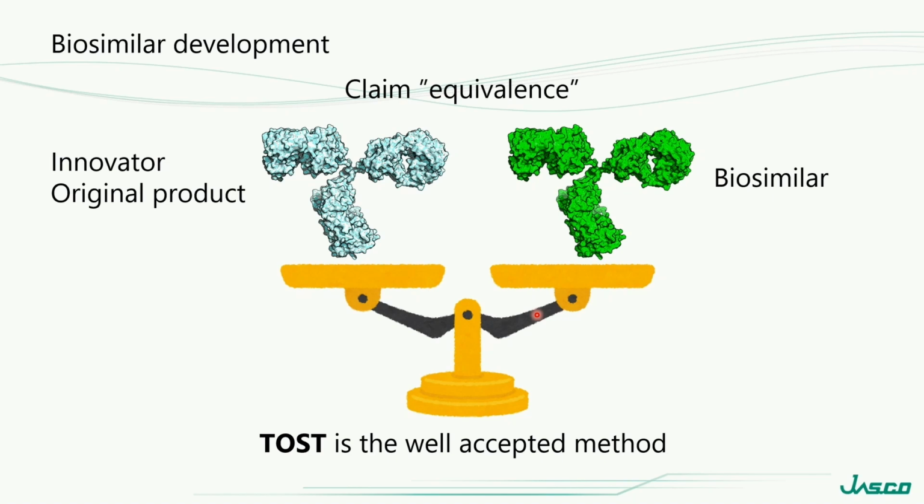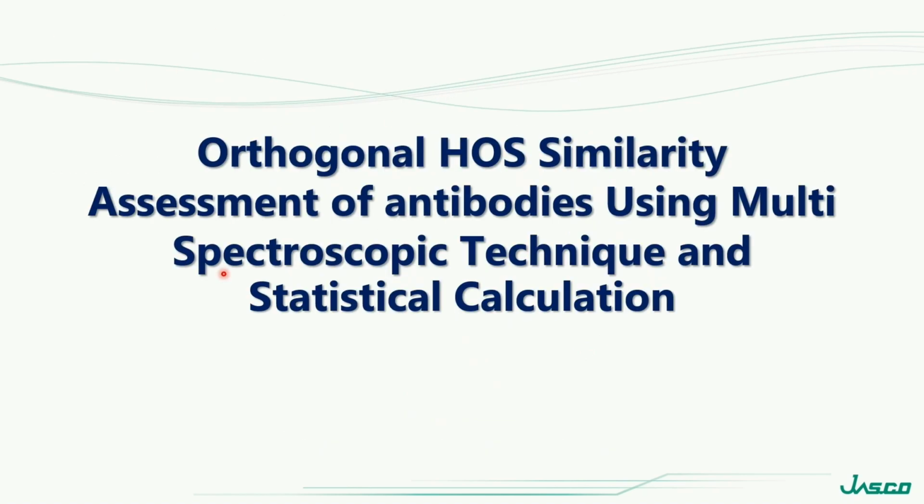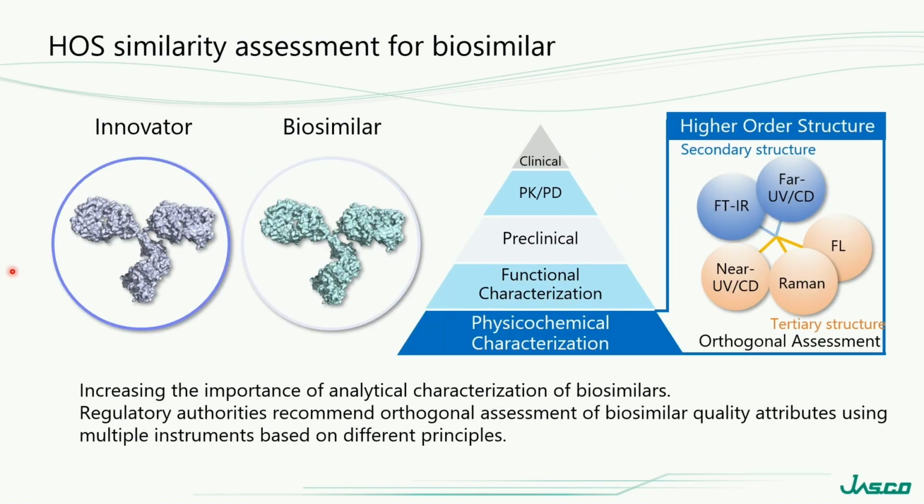TOST is well suited for the development of biosimilars, because TOST allows for the evaluation of the equivalence of a biosimilar to its original product. So let me introduce one of the applications applying TOST to compare the equivalence between innovator and biosimilar. In this slide, we use not only CD, but also consider the employment of FTIR and Raman spectroscopy.